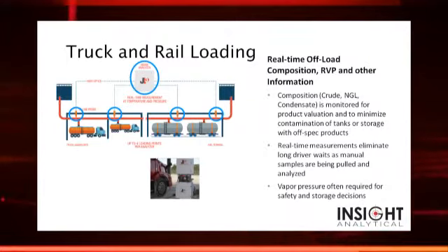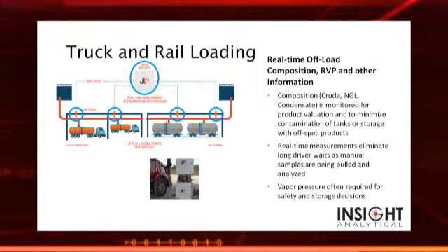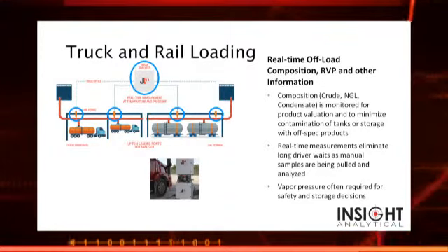So this allows us to make real-time measurements that eliminate people having to pull samples or having guys waiting while analysis gets done.